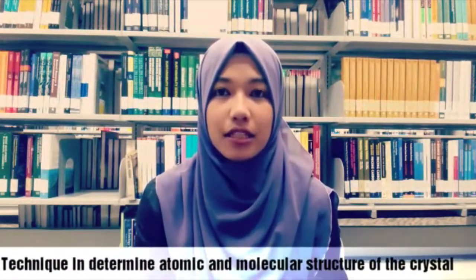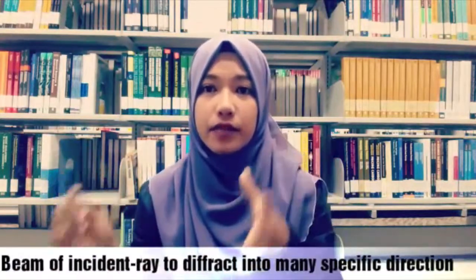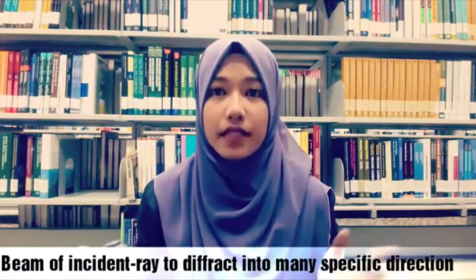What actually is X-ray crystallography? It is a technique used in determining the atomic and molecular structure of a crystal, in which the crystalline atoms cause a beam of incident X-rays to diffract into many specific directions. It has been used a lot by chemists, physicists, and others in industry.